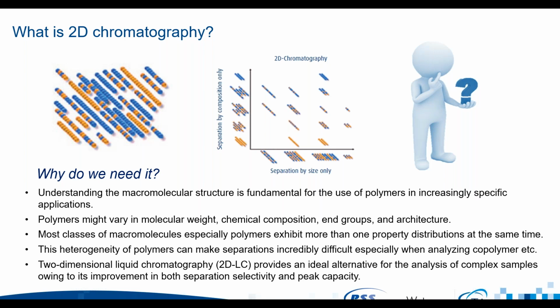So why do we need it? So understanding macromolecular structure is fundamental to the use of polymers.